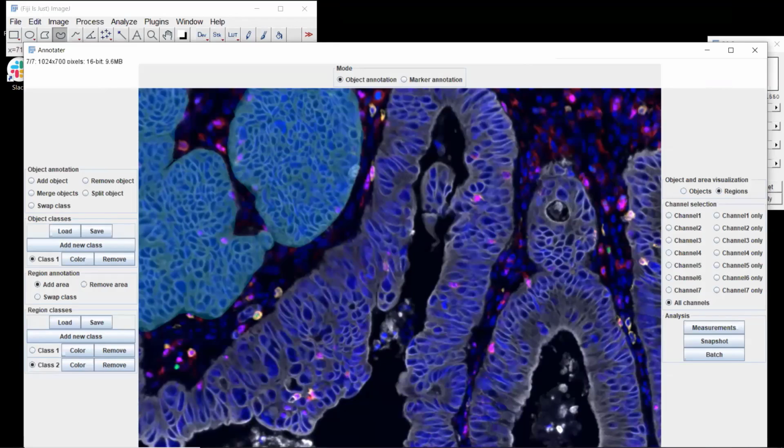So here it's a bit tricky because you have these different things. So I'm going to go a bit fast. It's not going to be perfect, but it should be fine still.